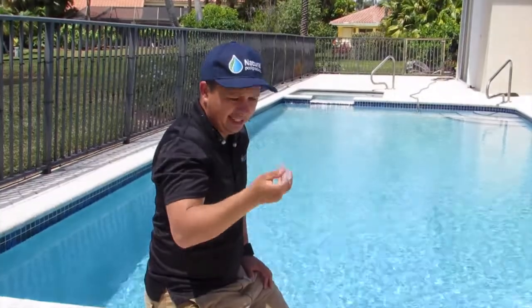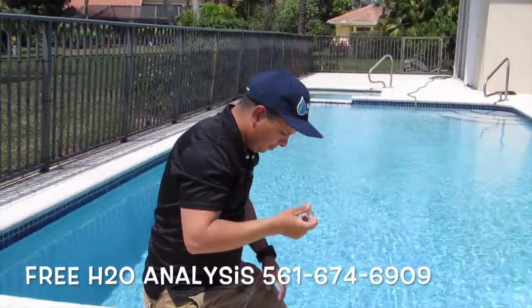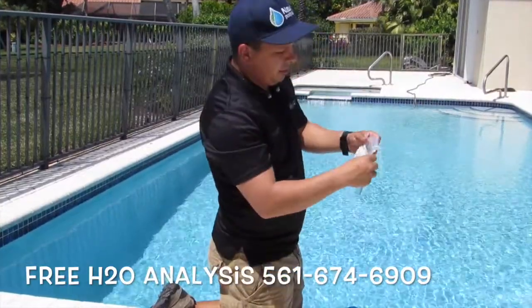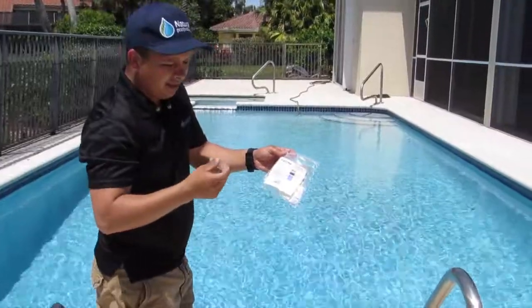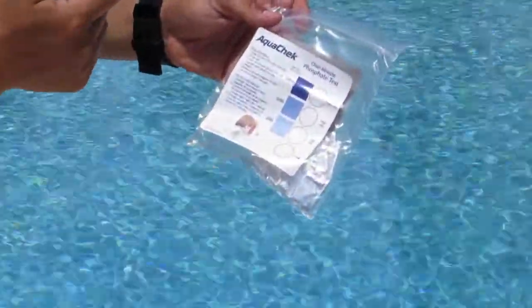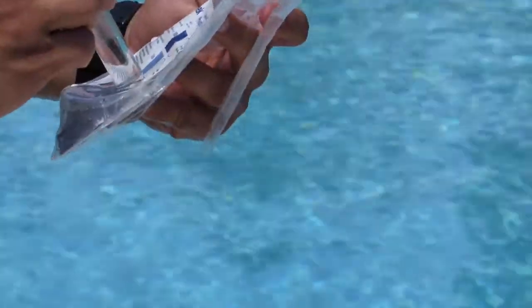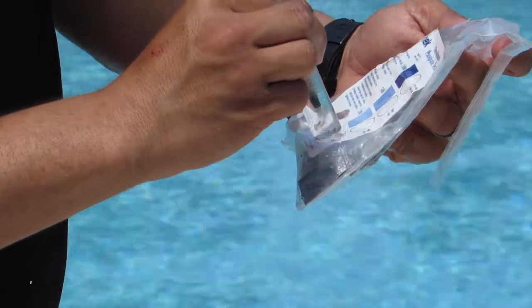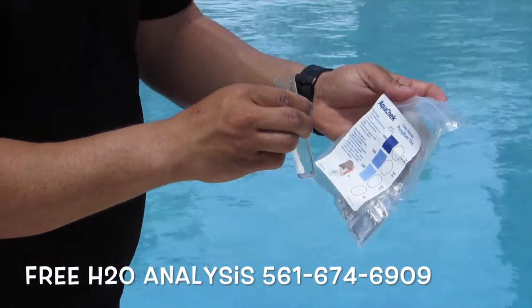I don't believe this pool has any. You grab the chart that has the reading on it, open the top, place it on top and look at it with one eye. As I believe, there's nothing — there's no phosphate in this pool.